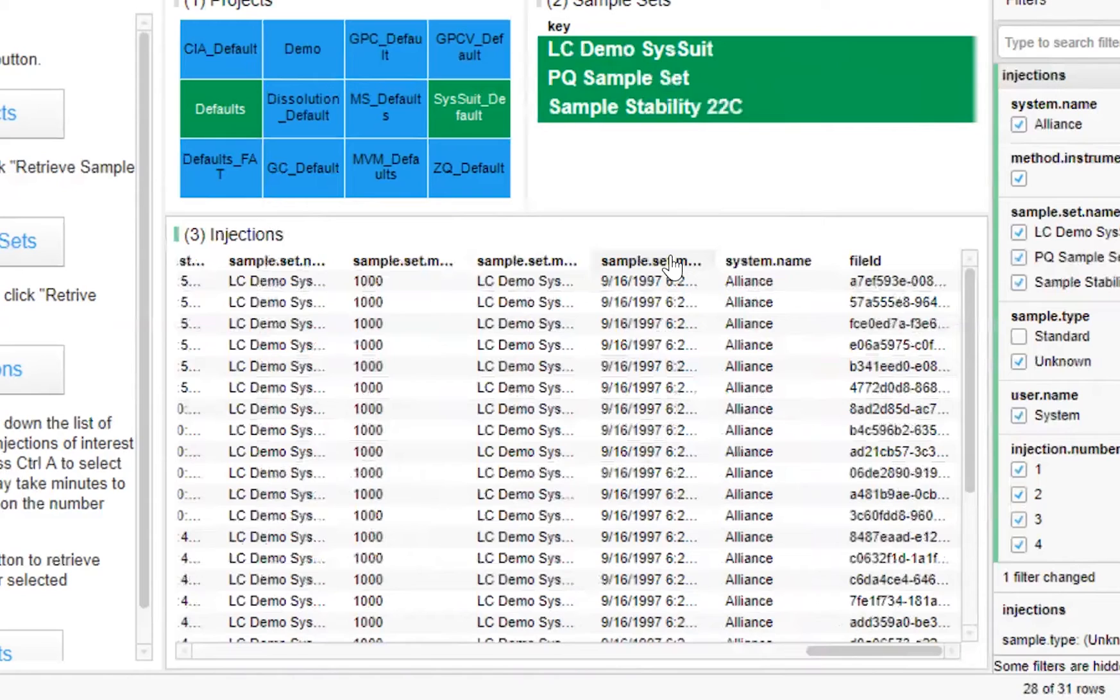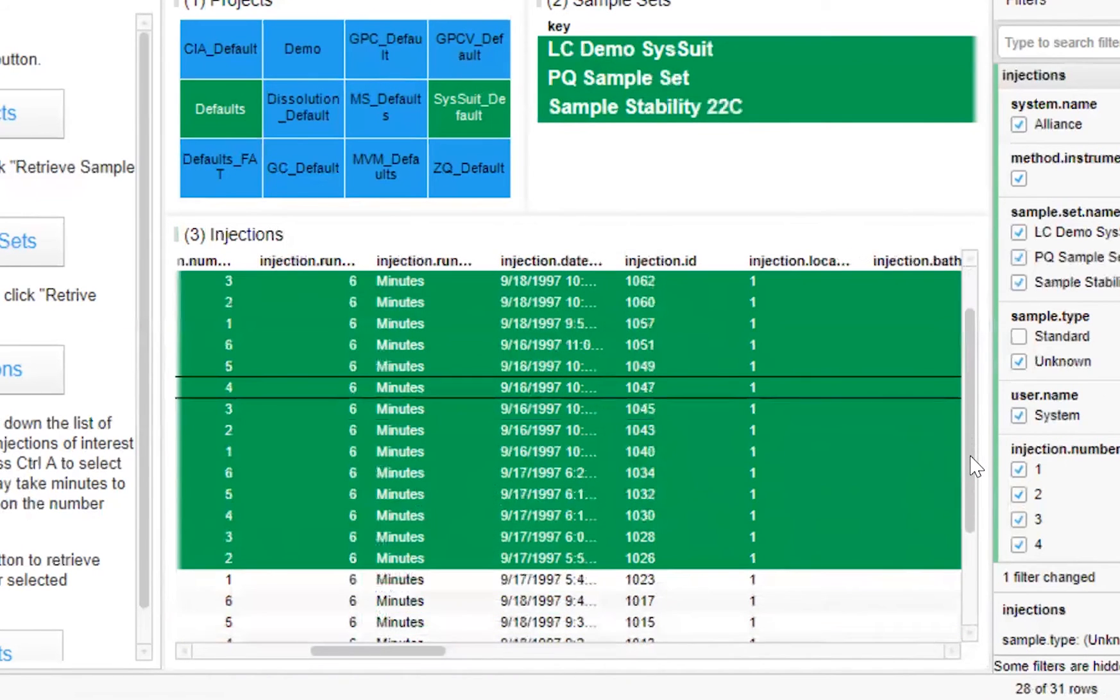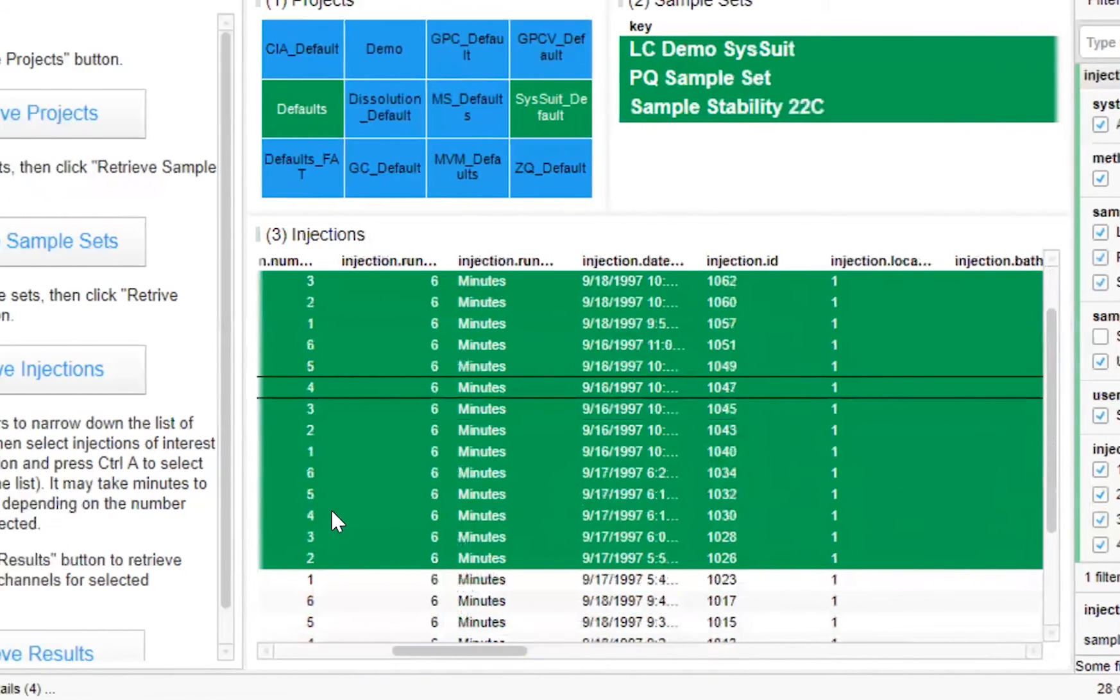Now, of course we want to explore our results. In this instance, we'll explore an injection that was processed by a particular user. We can make a selection, in this case, let's say the first 20 injections.